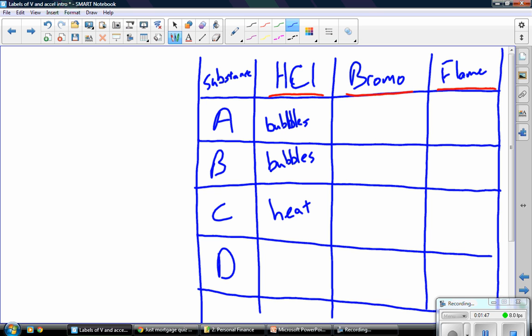I'm glad someone mentioned that. I want to talk to you briefly because I see this a lot. When you're dealing with a powder, or any substance really, but mostly powders, when you put it into a sample and then you pour a liquid on top, like hydrochloric acid or water or whatever, sometimes within the powder there can be a few little pockets of air. When you pour in the liquid, that pressure or the mixing causes little air pockets to open up and escape. So you do see 1 or 2 or even maybe half a dozen bubbles come up.